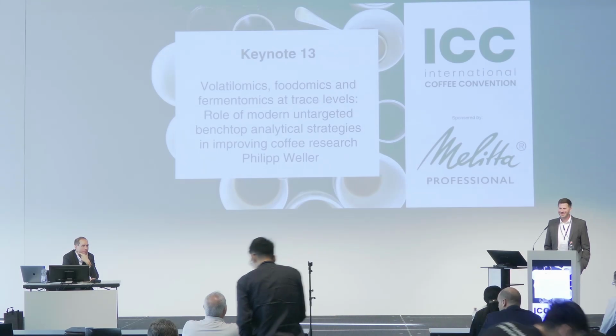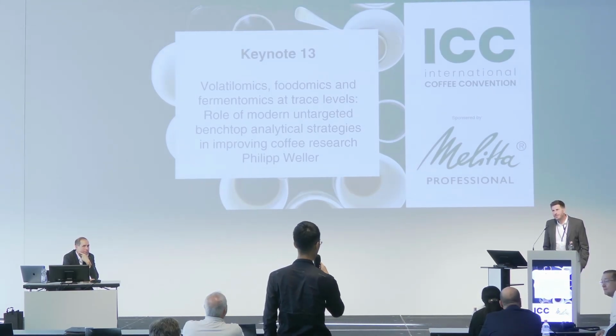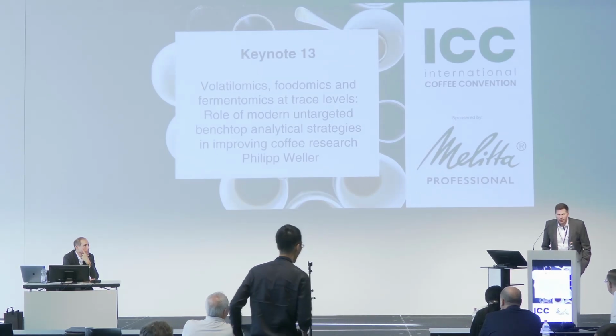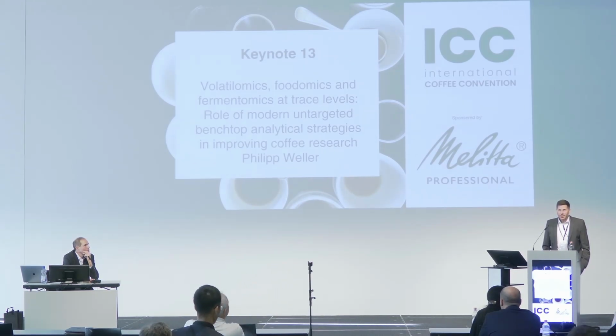Thank you, Doctor. I would like to ask, can the analyzer define the defect factors, or maybe the pollution factor, when we get a green beans sample? Yeah, so you're talking about defects, right? The simple answer: if the defects are volatile and ionizable in the system, which is most likely the case, because typically the defects will be beta oxidation products or whatever, then yes, I'm pretty confident that this will work.